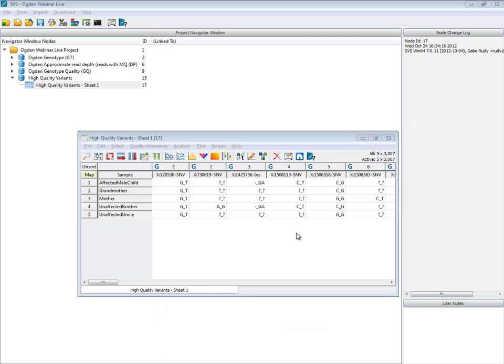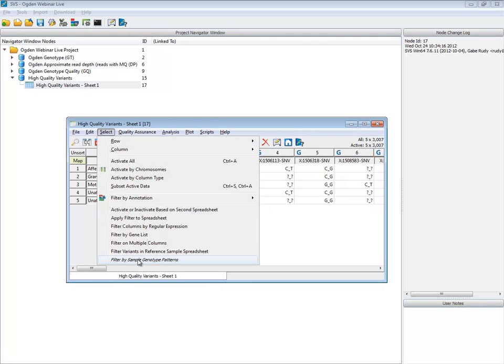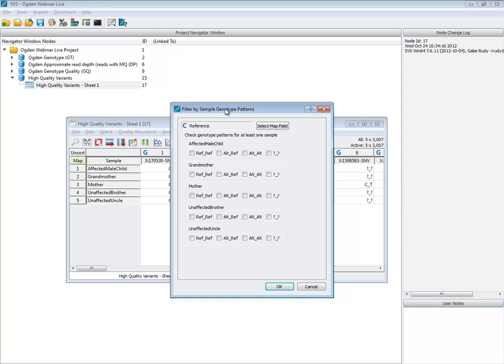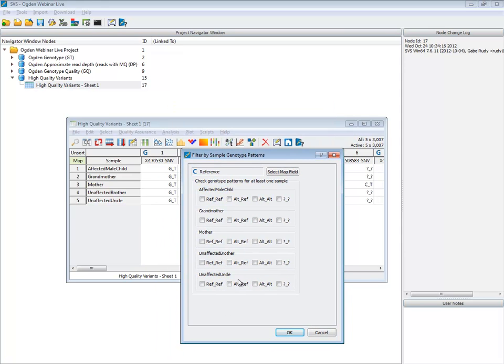So there we have our spreadsheet that has our high quality variants, which is our starting point. And we're going to go to Select, Filter by Sample Genotype Patterns. That's just a clever way of saying we're going to look at any variant site that matches that set of restrictions on what we would expect the genotypes to be for our individuals.